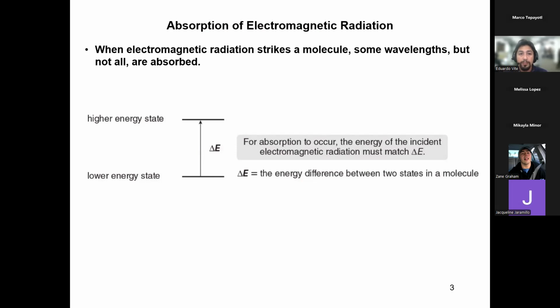We also use UV-vis to do other types of analysis depending on the molecules. Some molecules are more UV active than others. You could see in the TLC experiment that when we shine UV light at a molecule, it absorbs, and that's why you see a dark spot. So UV-vis does something very similar to that.